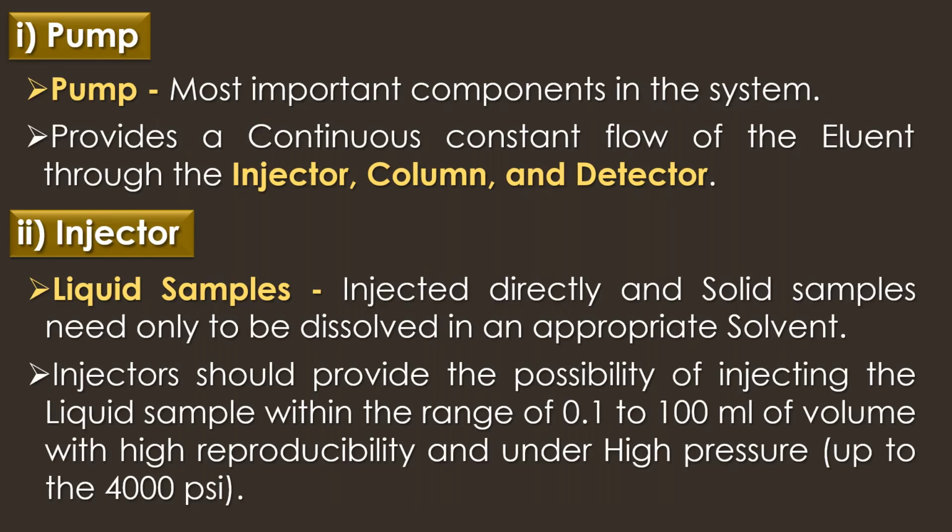The first part of the ion exchange chromatography is the pump. The pump is considered to be one of the most important components in the system. The pump provides a continuous constant flow of the eluent through the injector, column, and detector.